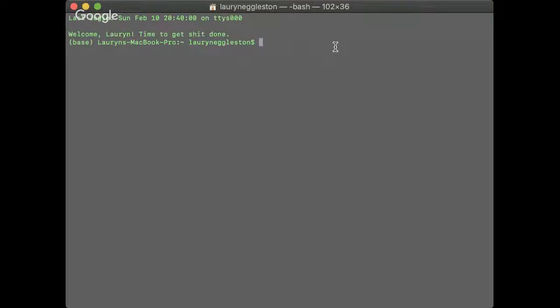Basically, I have already completed this protocol up to the point where I need to do analysis with the GFF compare in R, because I'm having difficulty installing some of the R packages. With the version of R that I have, it's giving me errors regarding DevTools.